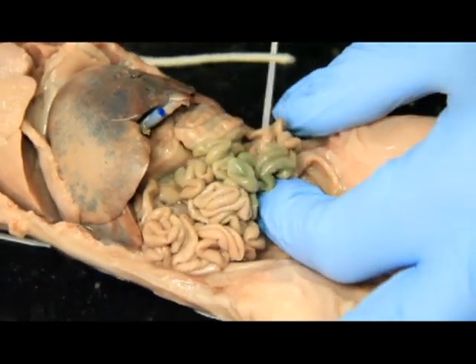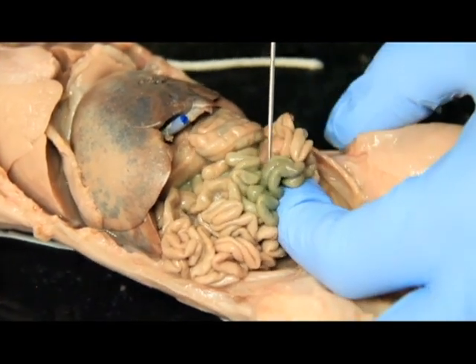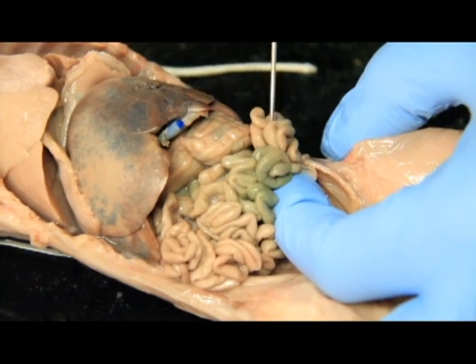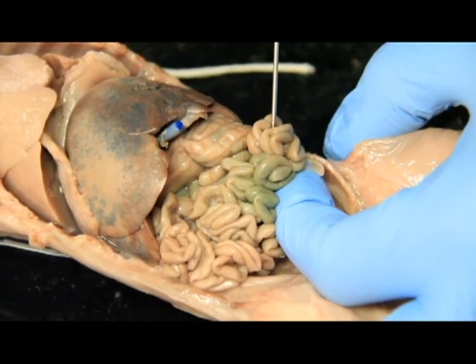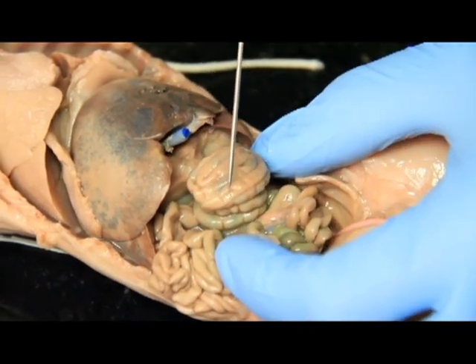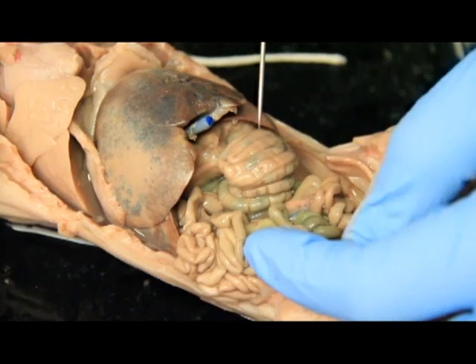And this has very little mesentery, and it kind of falls off here to the right. And this is our ileum. So this part all the way out here with very little mesentery that kind of falls off into its own little ball, that's your ileum right there. Now we've got this giant colon-looking thing in a spiral. You guessed it, that is our spiral colon.